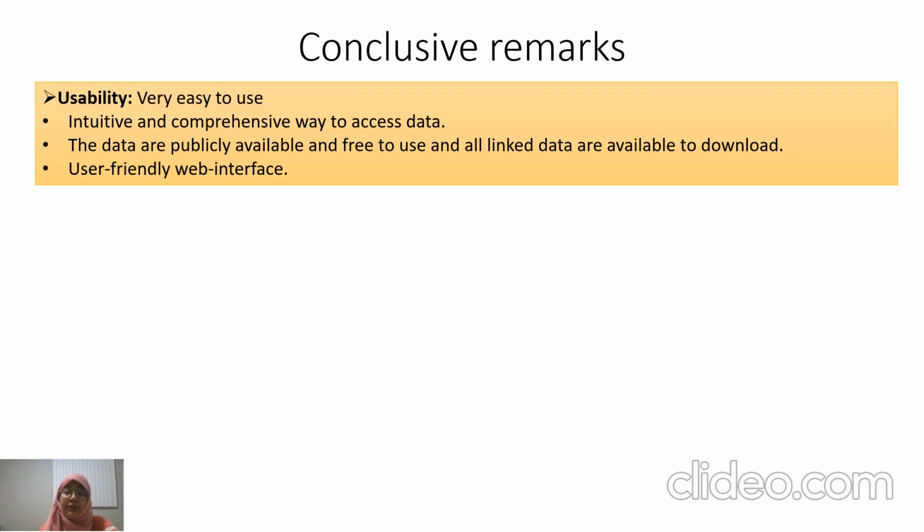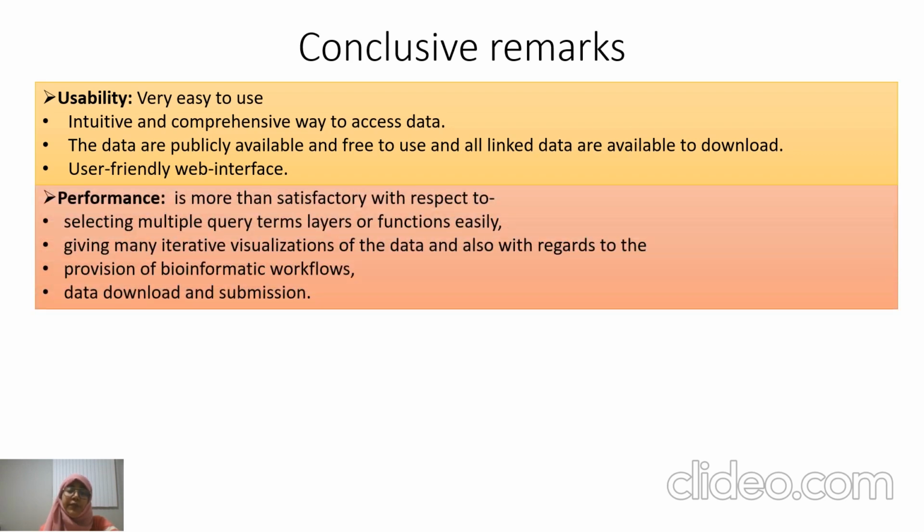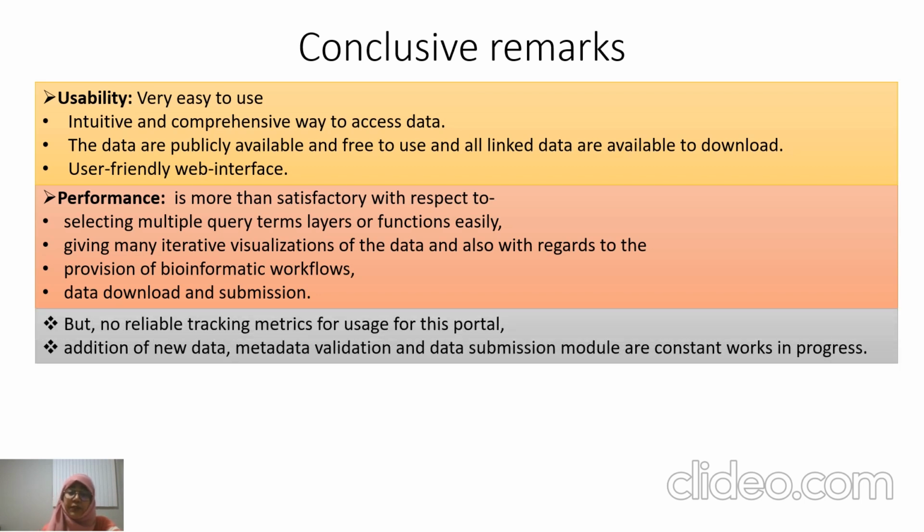making it a user-friendly web interface. The overall performance is very fast and excellent, considering you can select multiple query term layers or functions easily, giving many visualizations of the data, and also with regards to the provision of bioinformatic workflows, data download, and submission. However, according to Eloe-Fadrosh et al., currently there are no reliable tracking metrics for usage for this portal, which is something that's being developed.